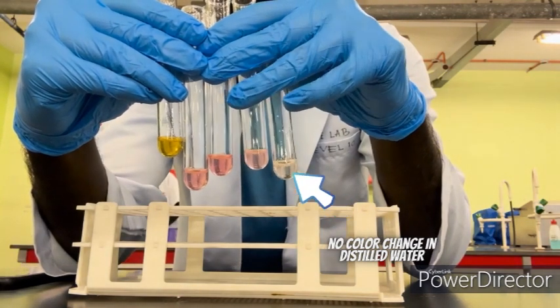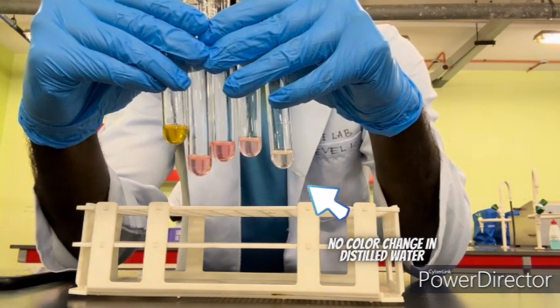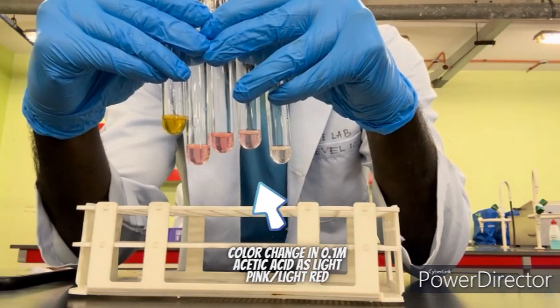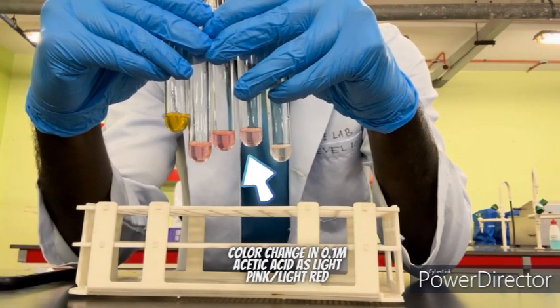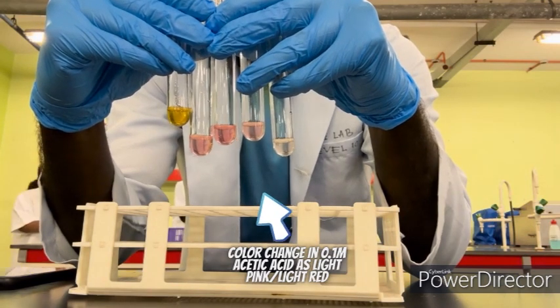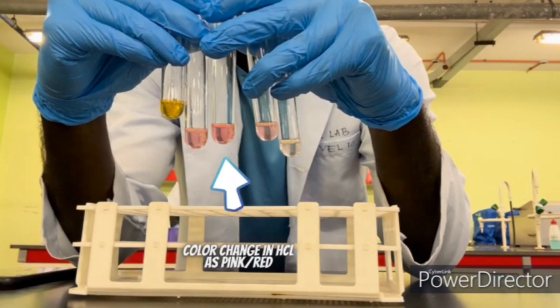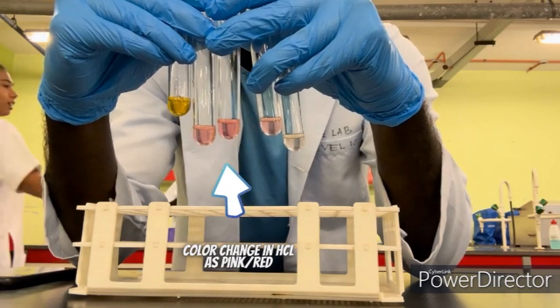Okay, so the first one is distilled water. We can see here there's no color change, so this one is considered neutral. The second one is 0.1 M acetic acid. We can see there is a light red or light pink color, a change of color once we added the onion peel extraction solution. So this one is considered an acid. And this one, the chemical is HCl, and it also changes color to a bit red or pink.